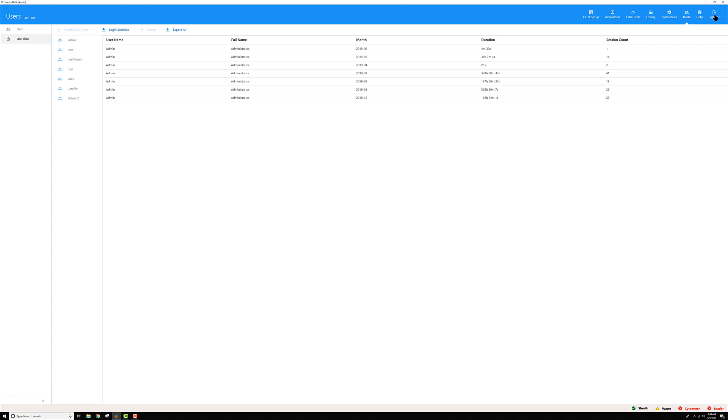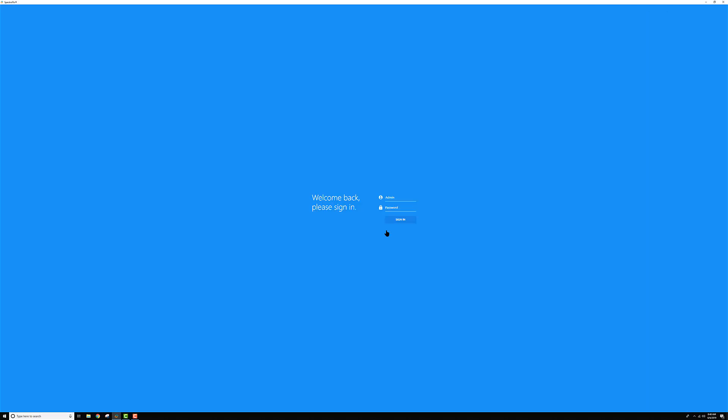When you're ready to sign out, you can click the sign out button. You can choose to save whatever changes you made since you last modified your experiments. I'm not going to bother this time around. Then I'm back out at this landing page.